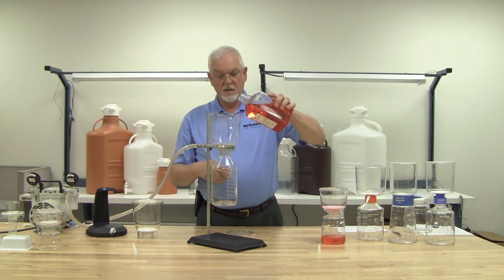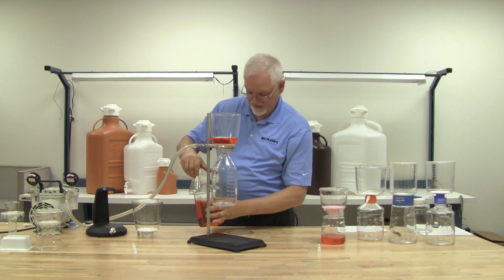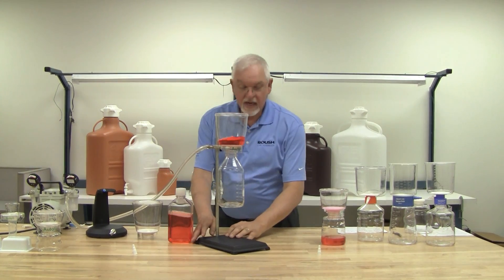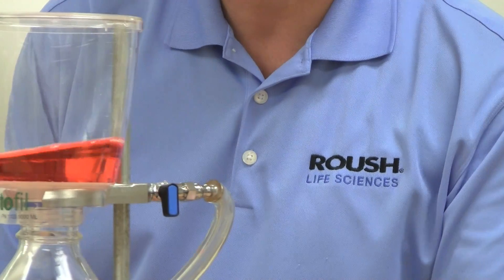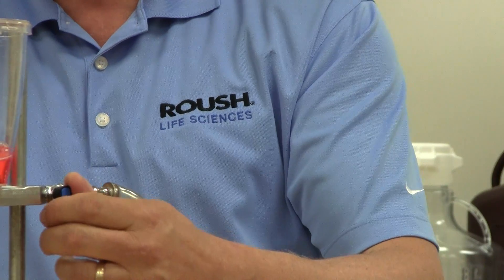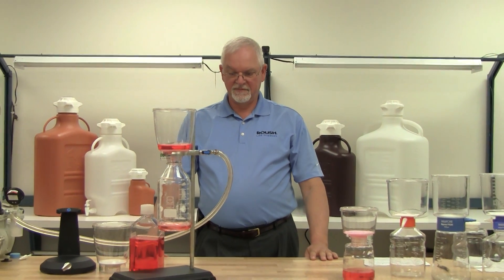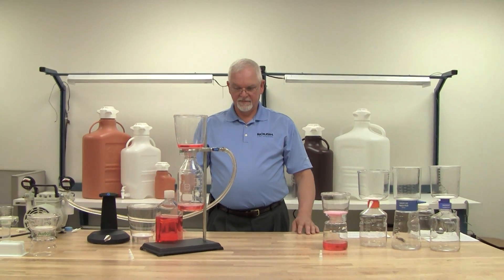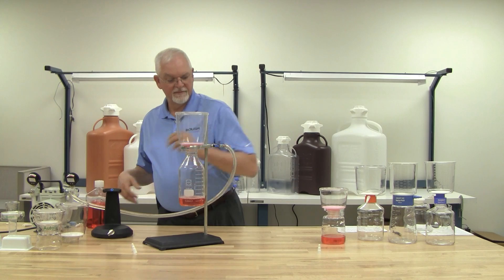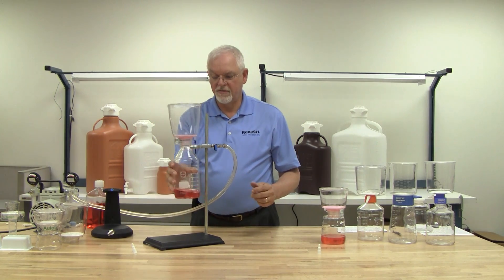Fill it in. Put on the cap. Turn the pump on. The controller is located right here. Turn it on and it filters hands-free. Comes right off, just like that.